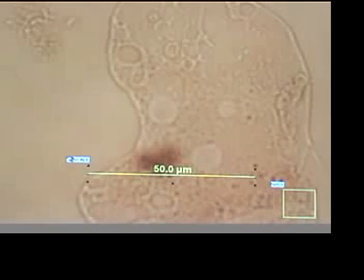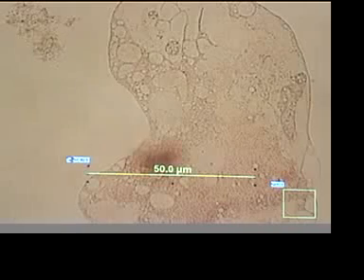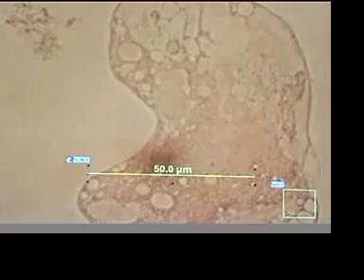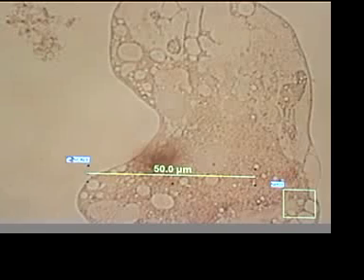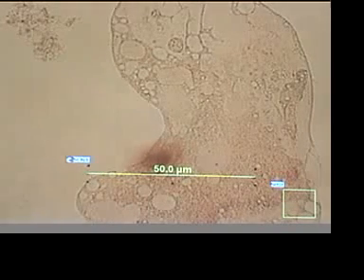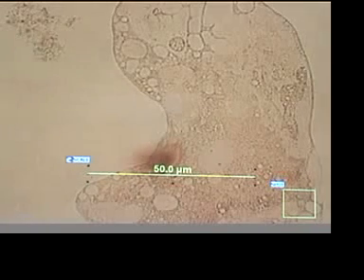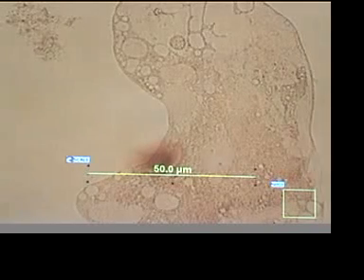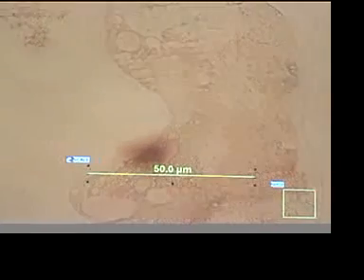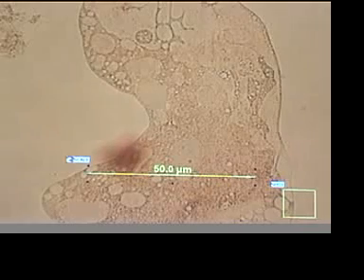And now you see it's pretty dramatic. This Blepharisma is just about totally dissolved. It really resembles more like an amoeba than anything else now. That scale is correct, and he's just huge.